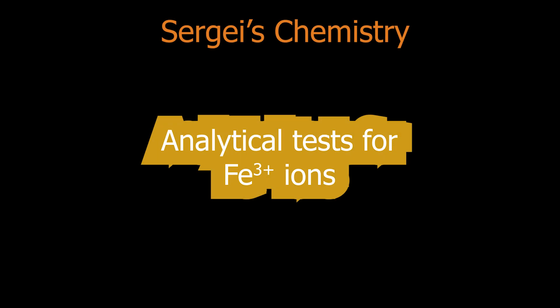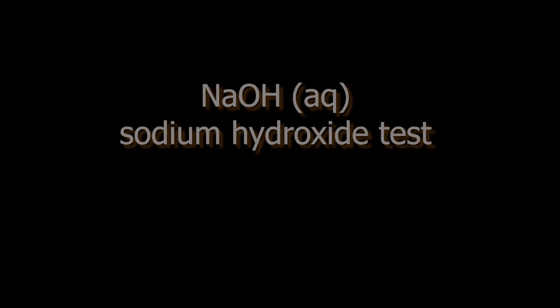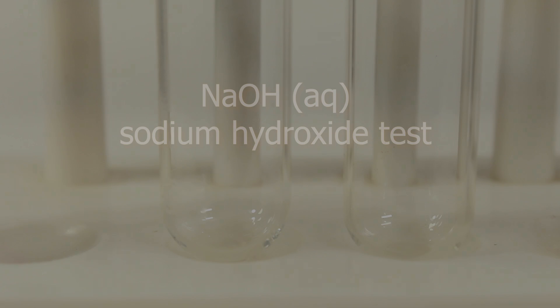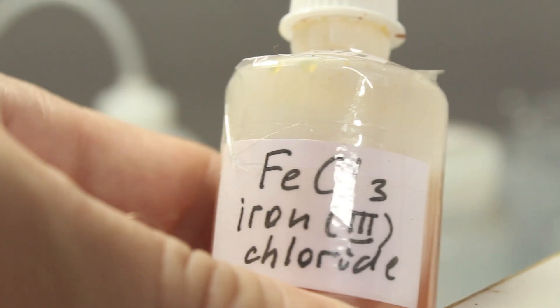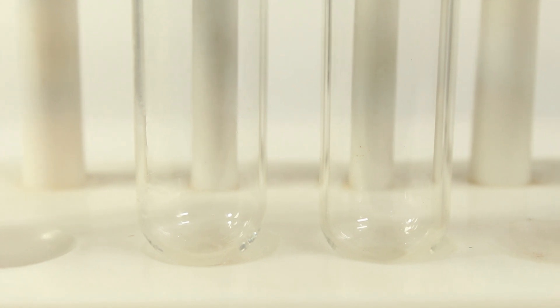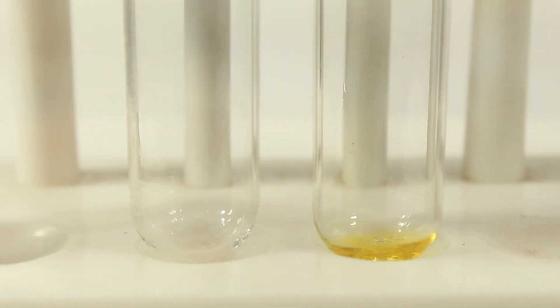Welcome to Sergei's Chemistry. Today we are looking at tests for iron-3 ions. First is sodium hydroxide test. Transition metal hydroxides are normally not soluble and they are colored. So this is the base for many of the tests.